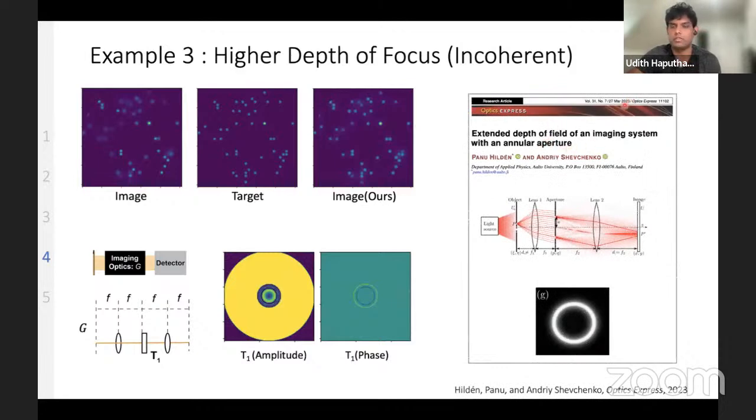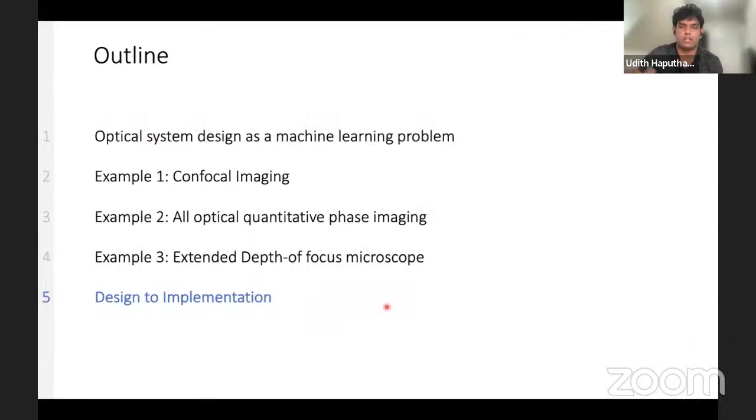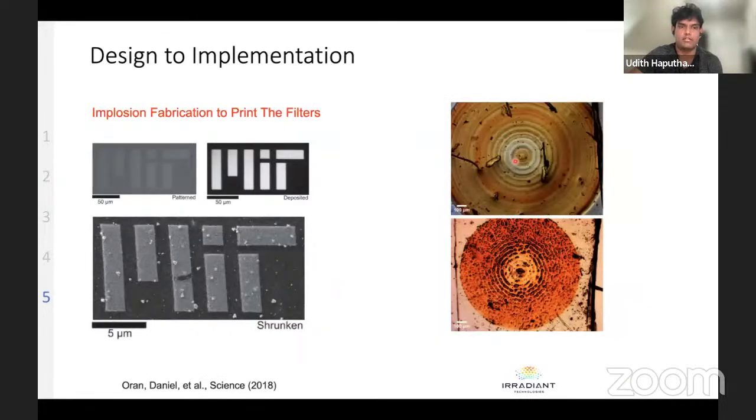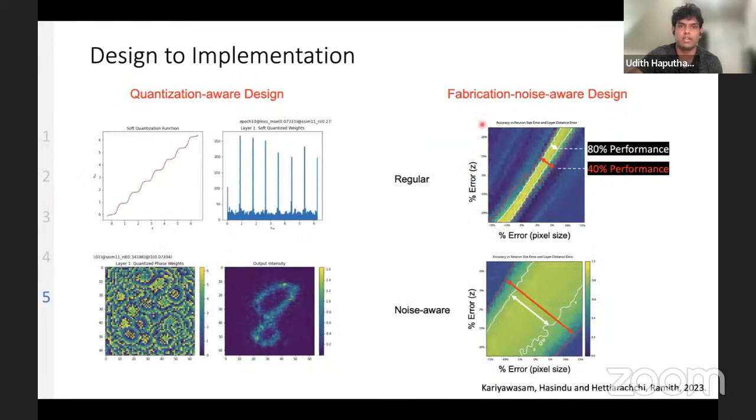there is a very recent paper, 2023 March, which tried to do this application, and they found that the optimal filter should be like this. And our learned filter has some similarities with this filter. So those are all the things from this work. Kipmini is mainly working on designing these filters, and Ramit and Hasdu are working on implementing quantization and fabrication aspects of these designs.